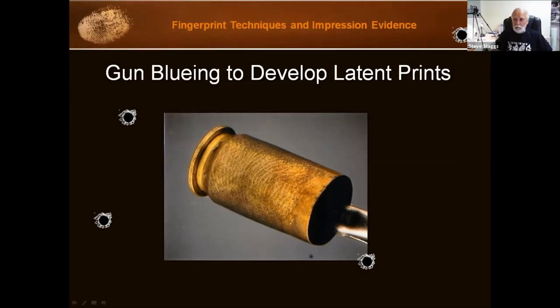Gun bluing to develop latent prints on cartridge cases. Getting fingerprints off of cartridge cases is not always easy. You're normally not going to get much DNA off of them because it's a cartridge case that's been fired. The intense heat that happens during the firing process will pretty much do away with DNA. You can still try, but it's a challenge.